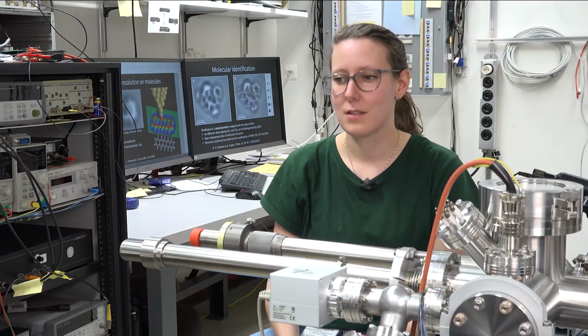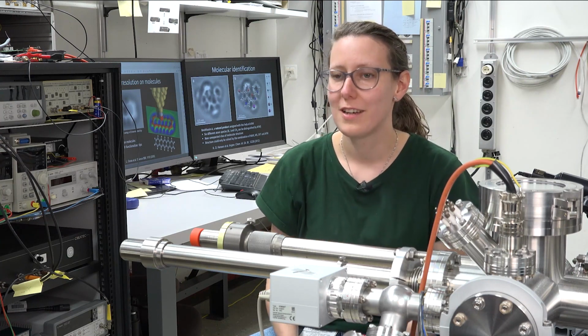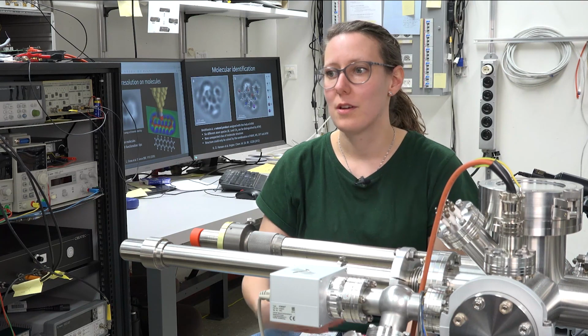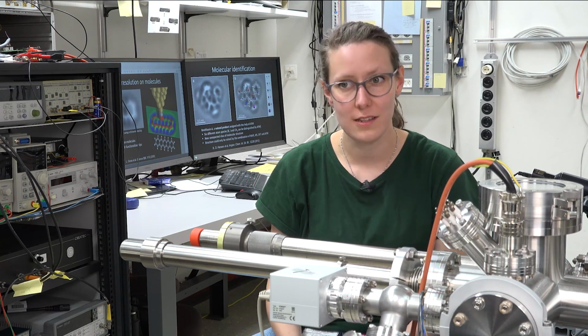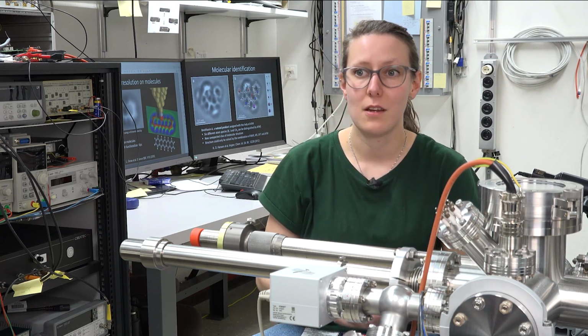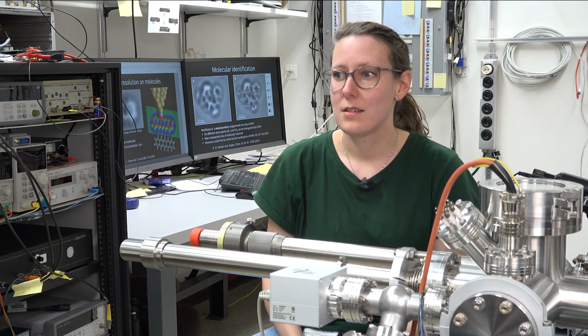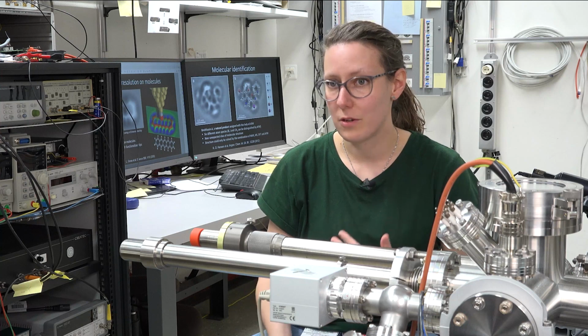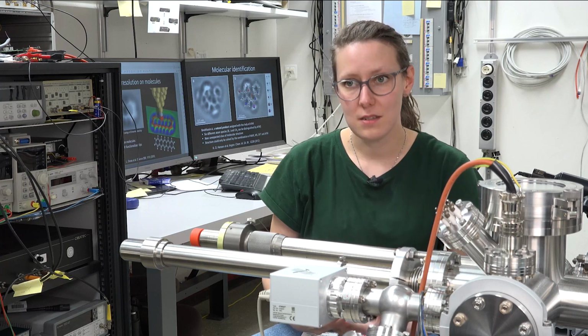We got a sample of the Murchison meteorite from NASA, and this we investigated using our low-temperature AFM. So we first got the pure meteorite sample, so it was essentially ground meteorite powder that we then tried to bring onto our sample surface to investigate it. But that was actually pretty challenging because this sample contains also a lot of molecules that we cannot resolve with AFM. And so one step along the process was that it needed to be, well, treated in addition.